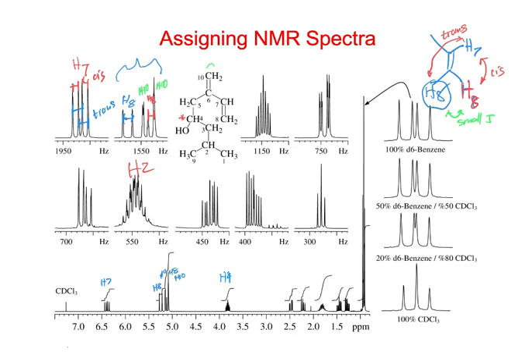And so, yeah, there's going to be 4 different coupling constants. And it looks like from the way the spectrum is, some of those might be multiples of one another. You know, if one's 2, the other one's 4 or something. And so they're kind of overlapping, but not every one.